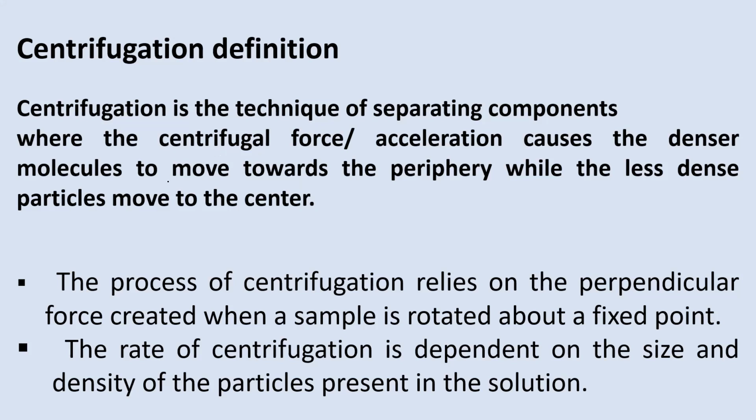So now the tubes will go away from each other. When you fix the tubes in the rotor, because of the centrifugal force, the tubes are going to go away from the center, away from the axis. So the denser molecules will move towards the periphery, while the less dense particles will move towards the center.